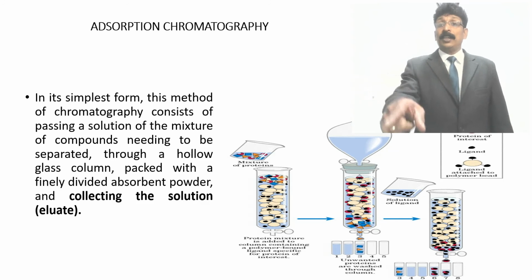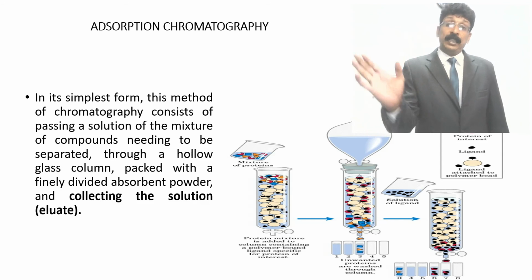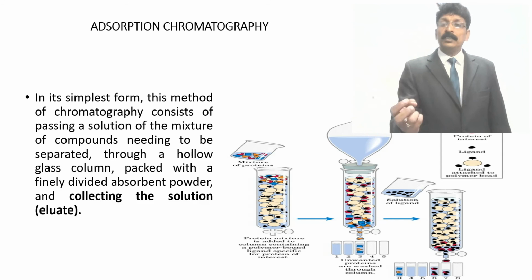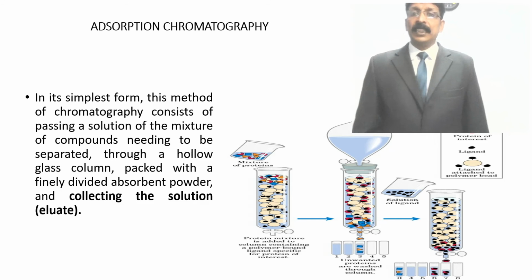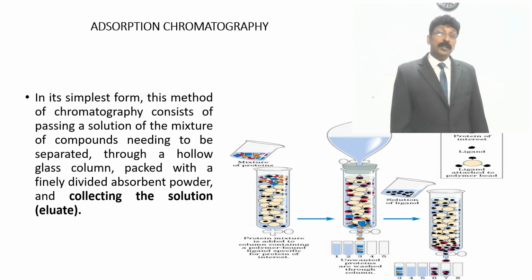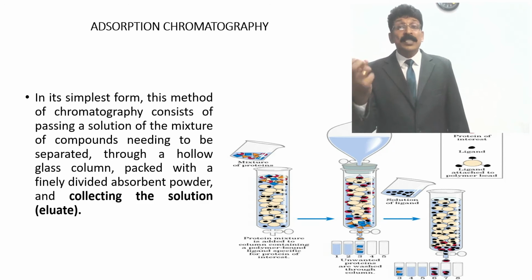But you can see in the 7th stage and also the 6th stage, the red color with a black spot comes down. After the others are removed, this alone comes because we are using another solution which can remove that ligand. When you add the solution of the ligand, it alone will remove what is attached to it.